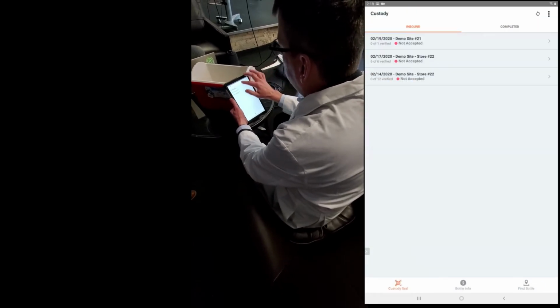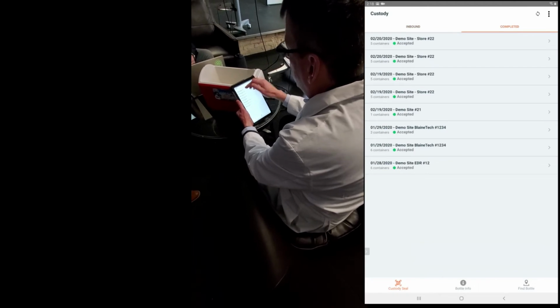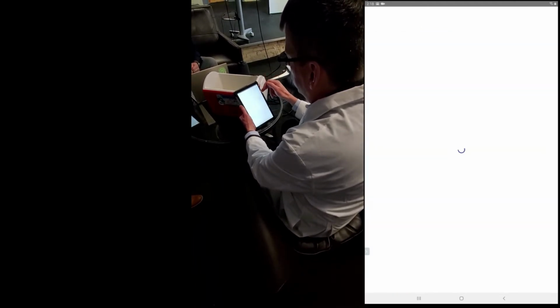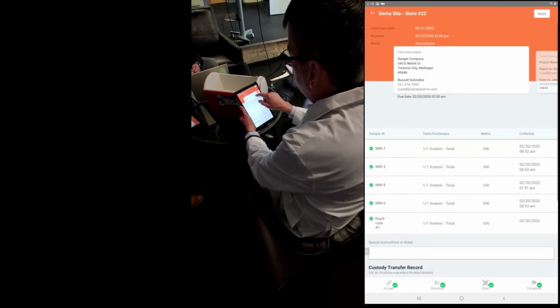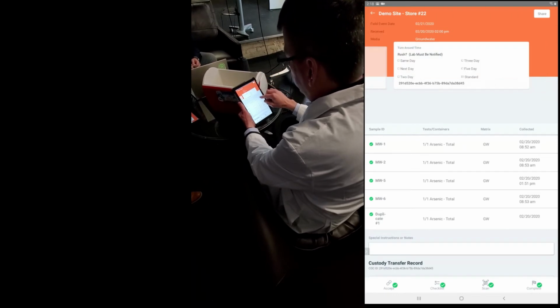And when I go back, we can see that's been completed, and here's the list. And you can go back in time to look at any completed transfer and see its details. See client information, project information, invoice information, shipping time, etc.